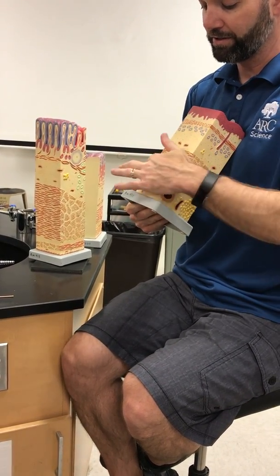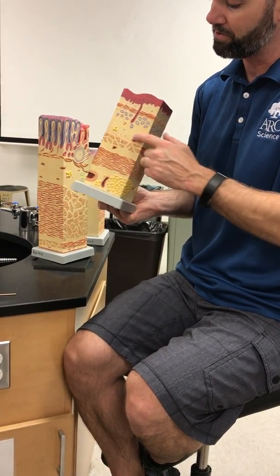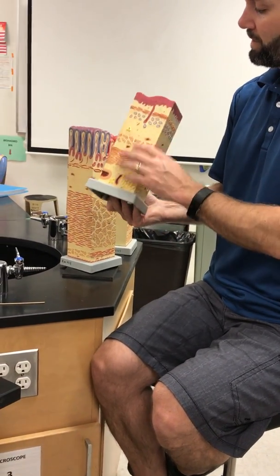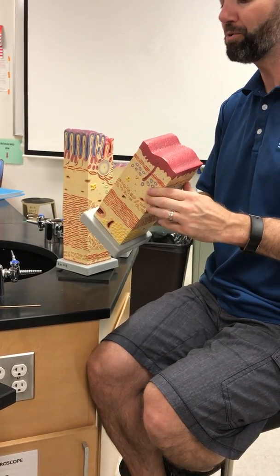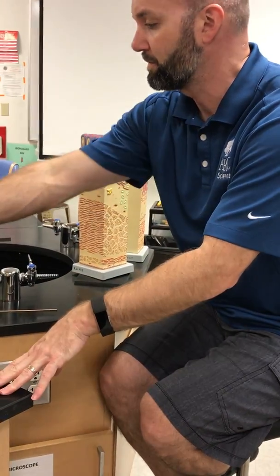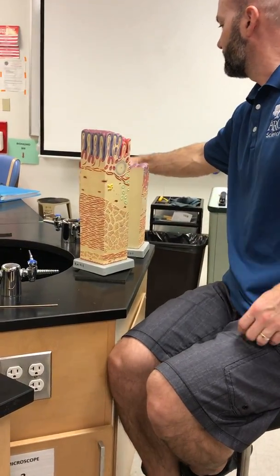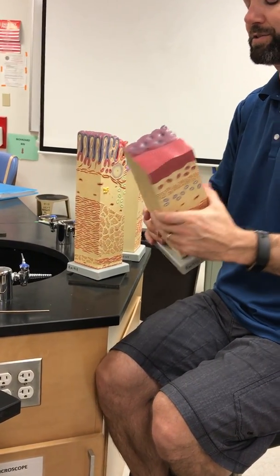And your inner circular and your outer longitudinal, a little bit of adipose there, some blood vessels. Up here, this layer, muscularis mucosa. What's the purpose of the stratified squamous? Protection. So we see it again here. So that tells you esophagus.